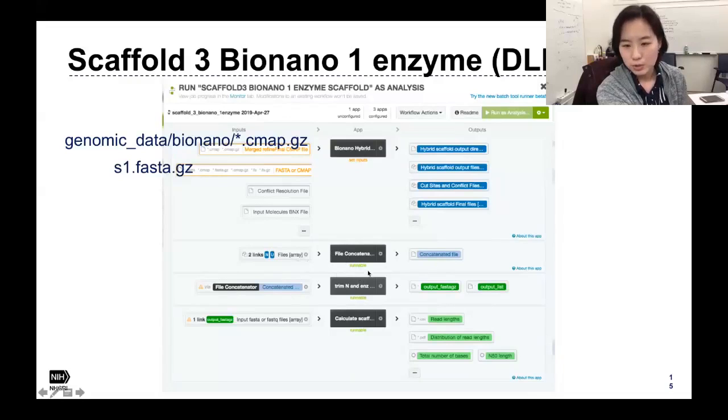And it's also useful to see the log that this step produces. It's this step, I think. It prints a warning in the output list for those scaffolds that have more than, I think, 70 or 80% of N bases in the scaffold. Yeah, and the last step here is, I think, provided from DNA Nexus that simply gives you a few statistics of your scaffold result.